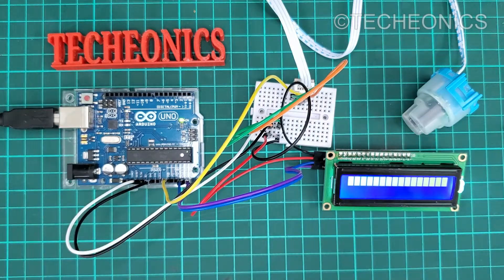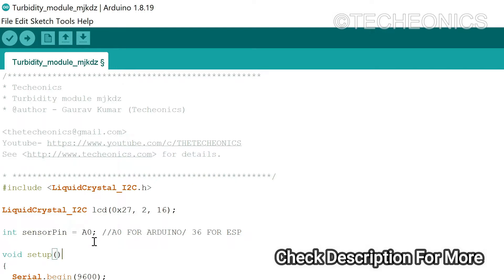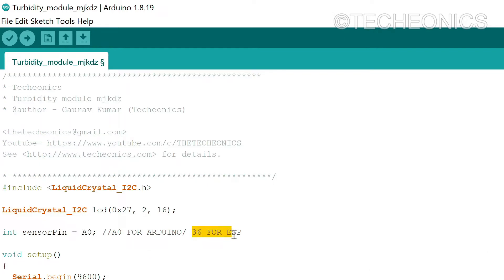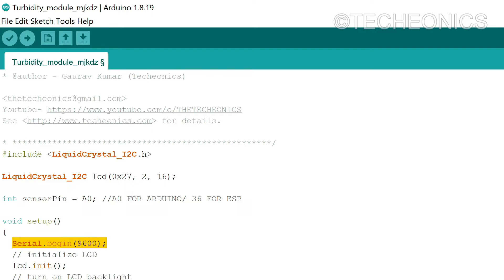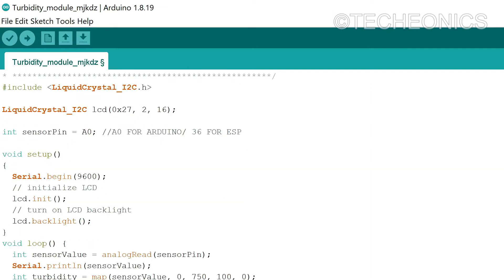Let's jump to the programming. Here we have the code for our sensor. First of all we add the library for the LCD display, then define the address of the display. Then we have defined the pin of our sensor — since the sensor gives us output in analog, we have defined the A0 analog pin of the Arduino. If you are using ESP or ESP8266, you can define pin 36 for the ESP32. Then we initialize the serial print function and the LCD function. In the loop, analog read stores the sensor value and then we map the value for the turbidity. The LCD will display the values of the turbidity sensor.